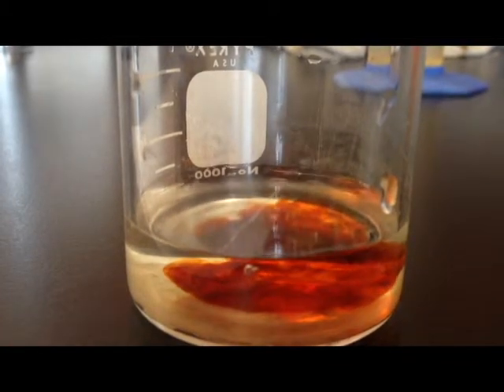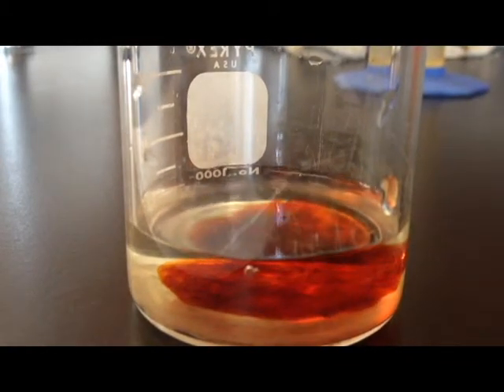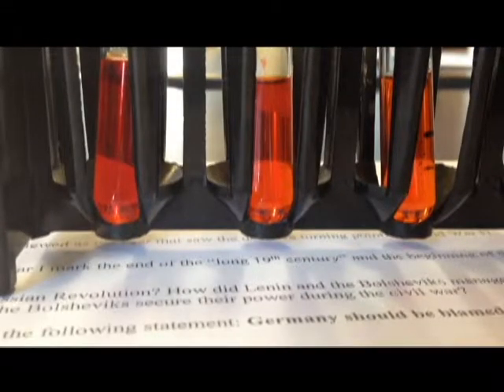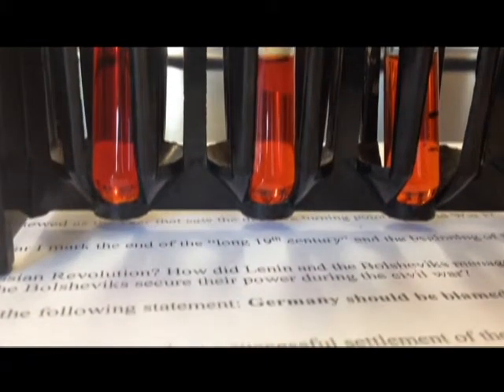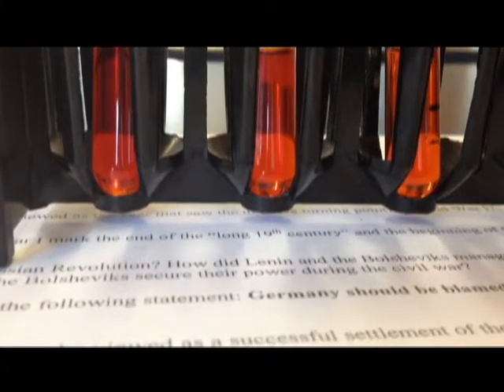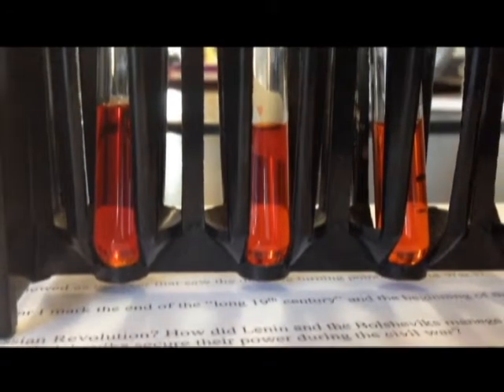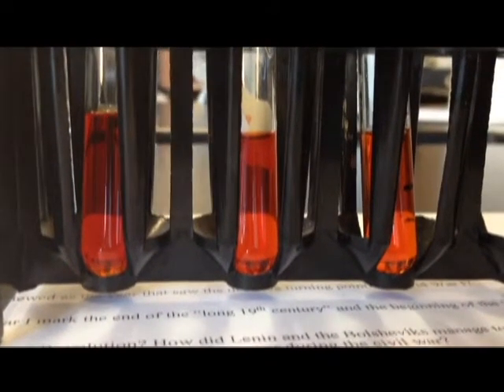We then aliquoted out 3 milliliter samples of this complex ion solution into 3 test tubes. To the first test tube, we added 20 drops of 0.1 molar iron nitrate. This resulted in a color change from red-orange to a deep red.